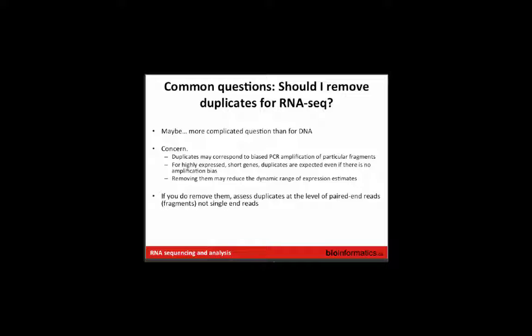When you have really bad amplification bias, it does have a signature. You don't just see more data everywhere or more duplicates everywhere. You see certain spots where you have this pileup of alignments that are all the same fragment, piled to the ceiling. You can actually see these just by looking in a genome browser at your data. You'll see this really blocky signature in your alignments where, in periodic spots, you get slammed with thousands of copies of exactly the same fragment, disproportionate to the level of coverage otherwise in that area. Those are areas that, for whatever reason, tend to over-amplify.